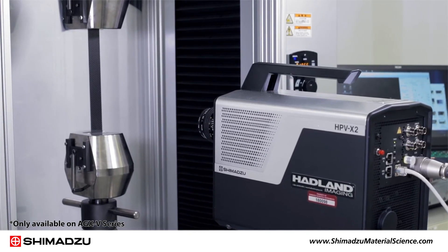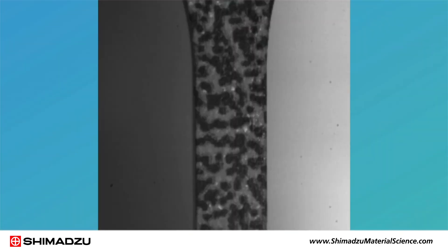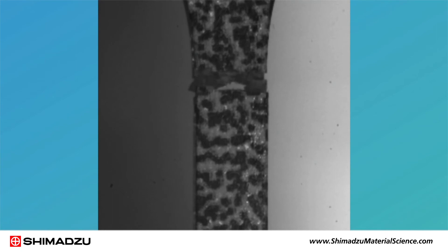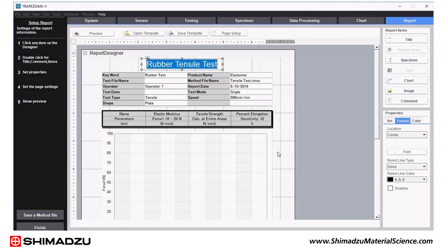Once your tests are complete, Trapezium XV makes data retrieval and reporting easy too. When you're ready to produce a report, use the report designer to build custom templates that include data, graphs, images and even logos.